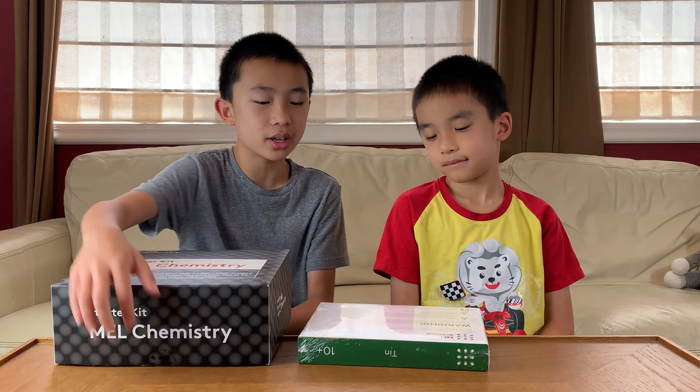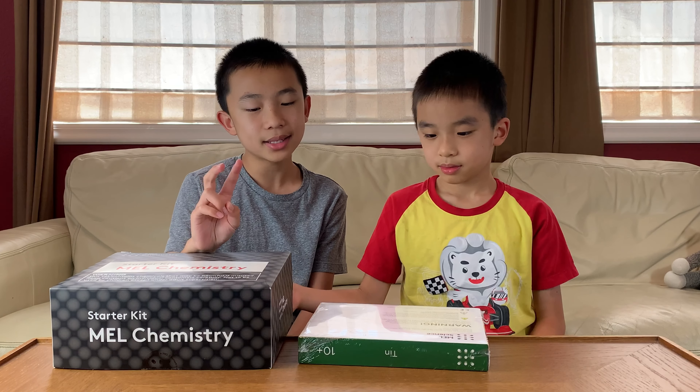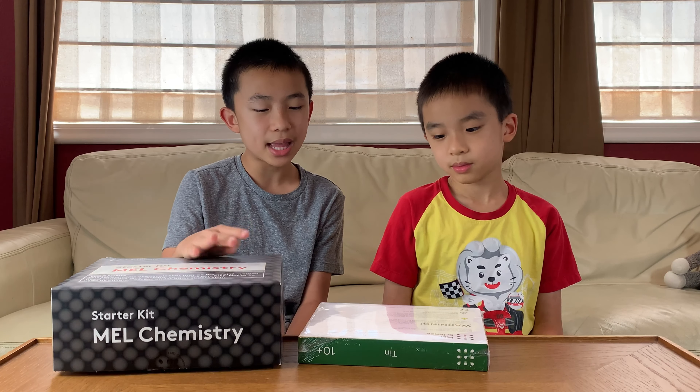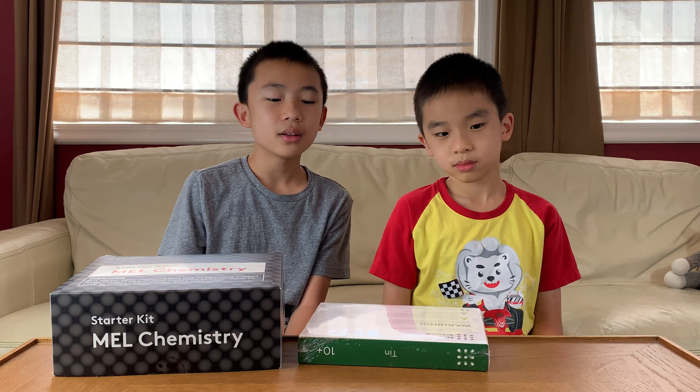From the starter kit, they also tell you what you need. So we're going to need the plastic tray, safety glasses, the smartphone clip-on macro lens, and the smartphone stand. We also need to prepare in advance four triple A batteries.